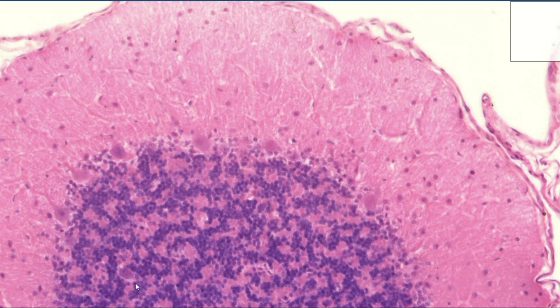In this photo we can see a quite large perikaryon between the granular cells — this would be a Golgi cell. It is quite irregular and quite a large cell.